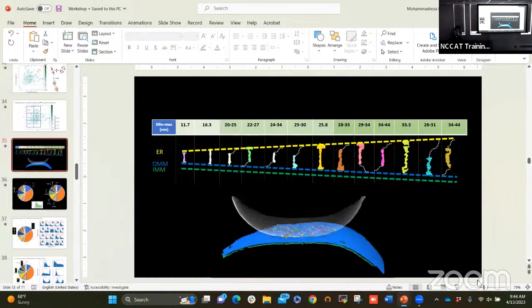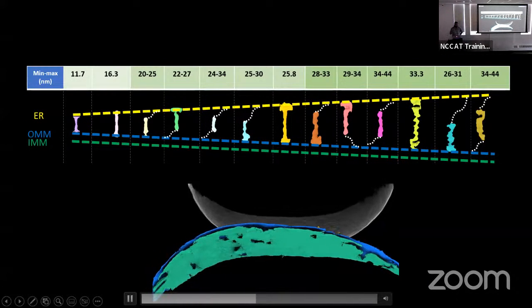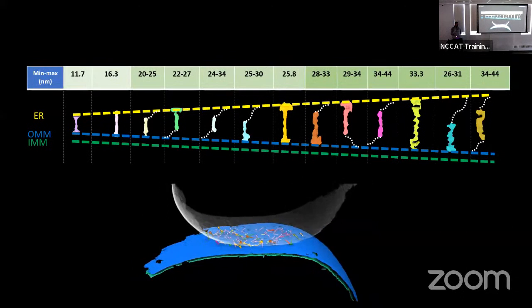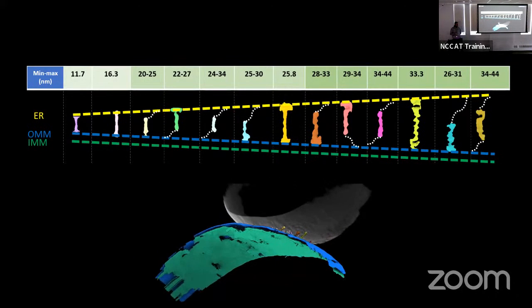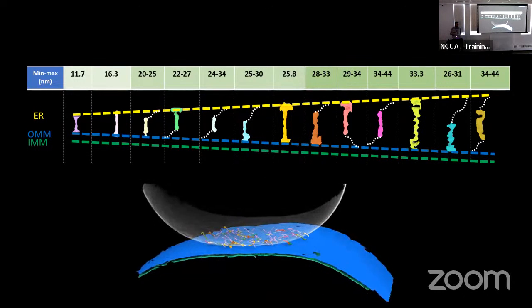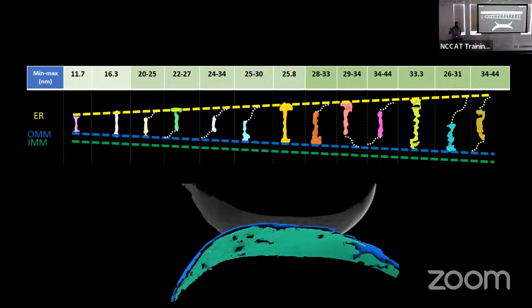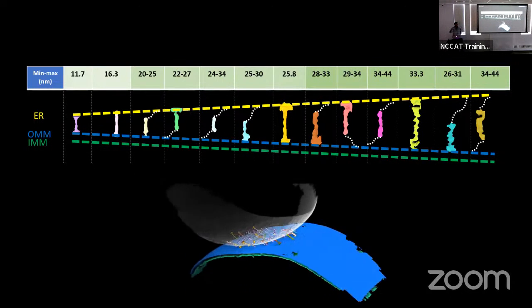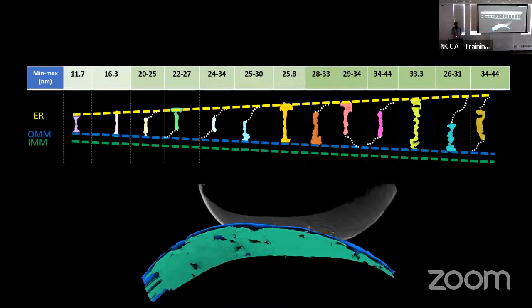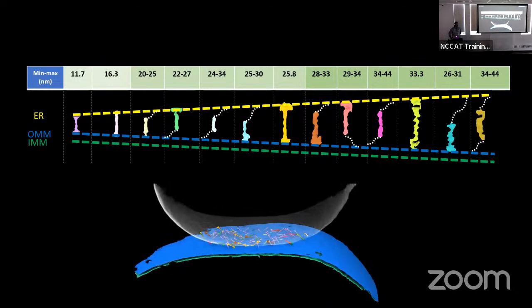All right, and then I used ArtiaX, which is now a plugin in ChimeraX, to trace these back. You import your Dynamo table or your star file or your coordinate file. It takes in different formats. You open your segmentation and then you assign your maps to each class of particles, and it creates a beautiful visual of where your subtomograms are in the tomogram.